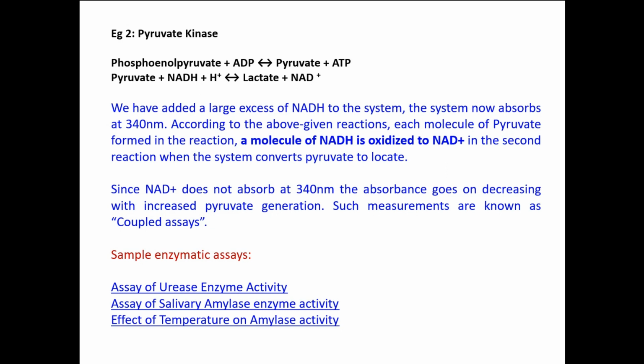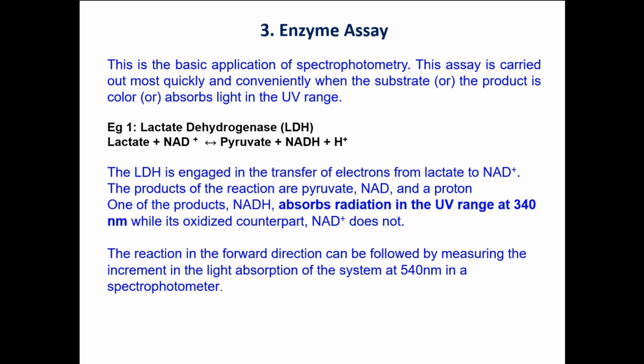So that means the pyruvate is the substrate for the conversion of pyruvate plus NADH plus H plus into lactate plus NAD plus. See, in the previous reaction, we saw that the lactate dehydrogenase enzyme catalyzes a reversible reaction. Lactate reacts with NAD plus, which gives pyruvate and NADH plus H plus. That is what we saw in that one.